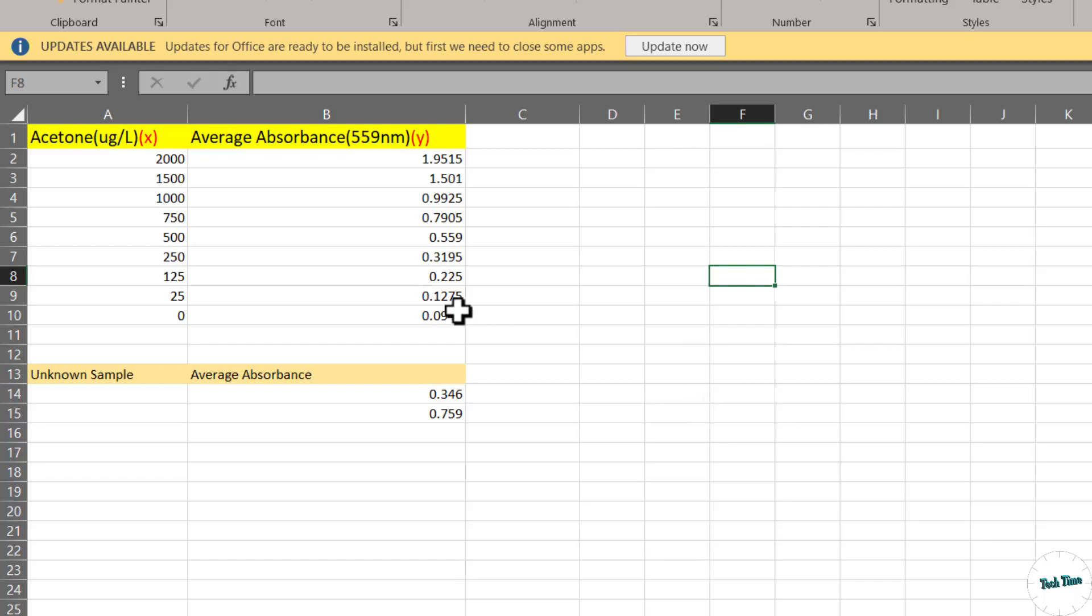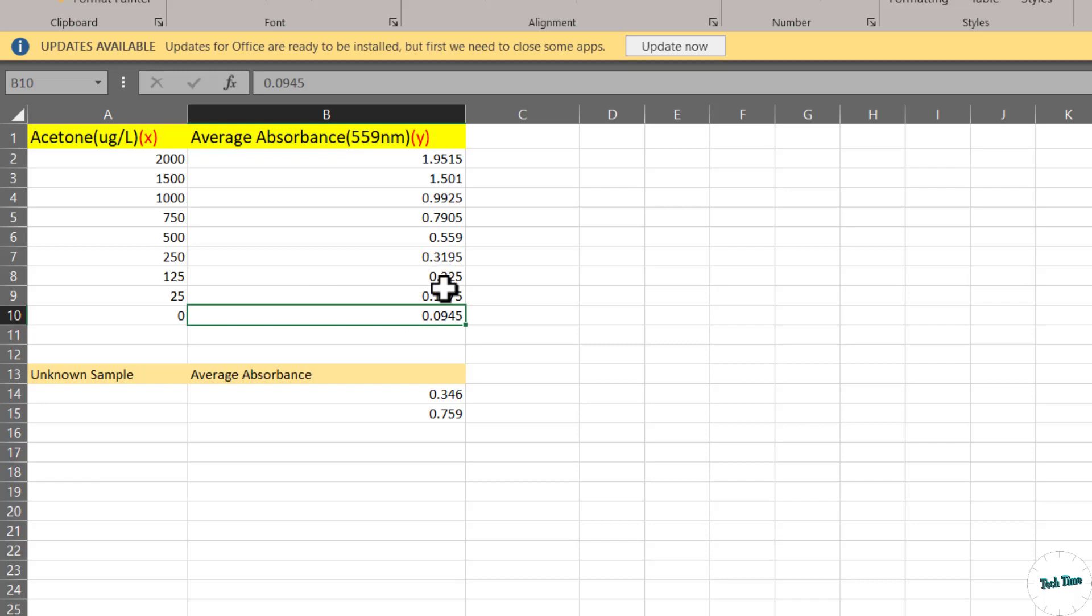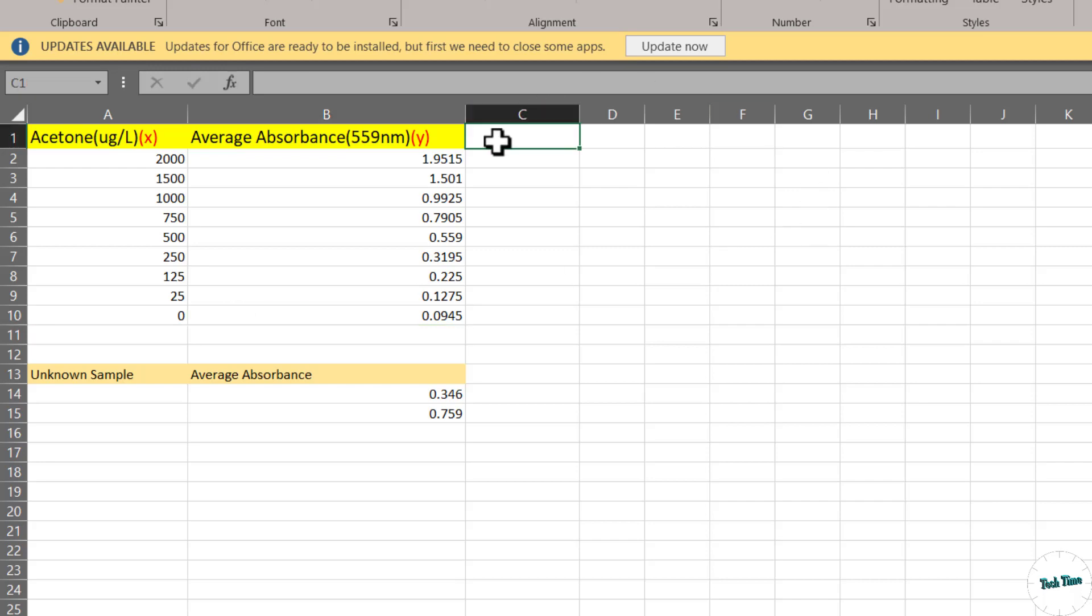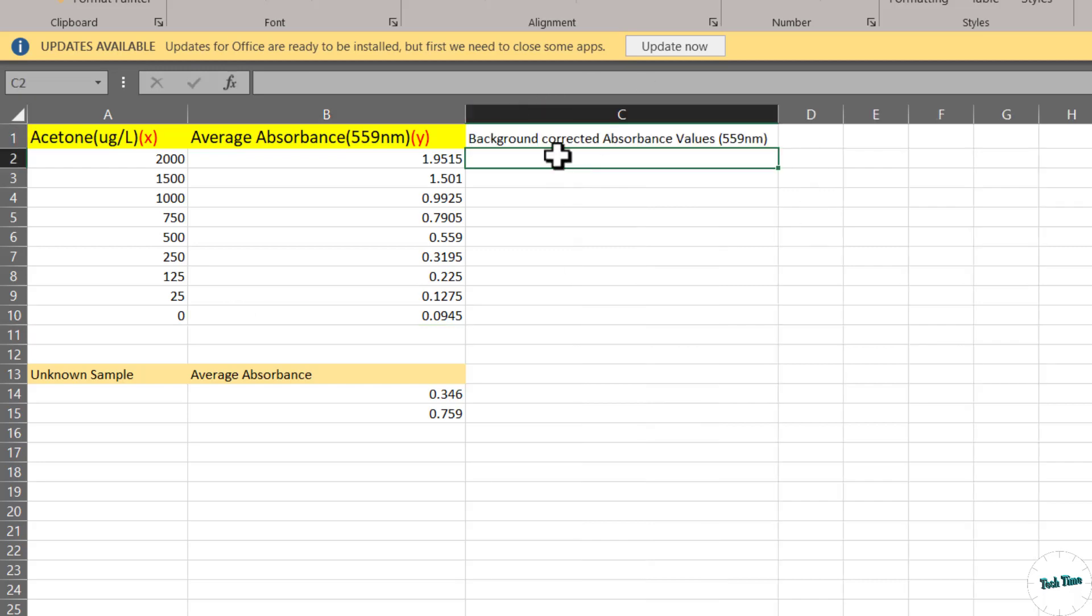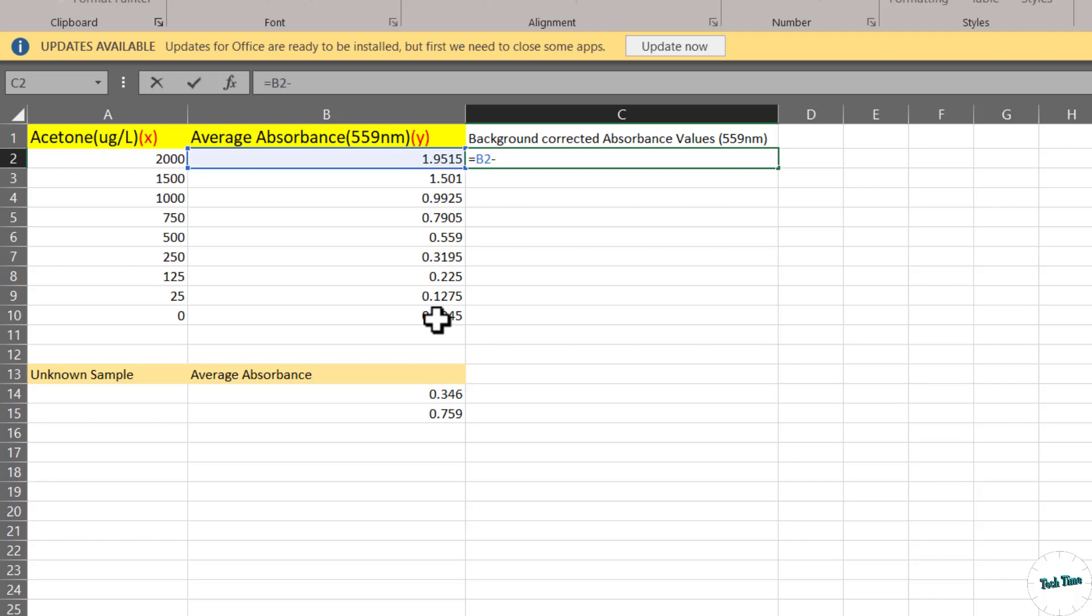The first and foremost step is to subtract this absorbance value from all these absorbance values. The values obtained will be called background corrected absorbance values. Let me put it over here. Just to do this, we'll insert equals, take the first sample minus the absorbance value for the sample without any acetone. Let's choose this one.